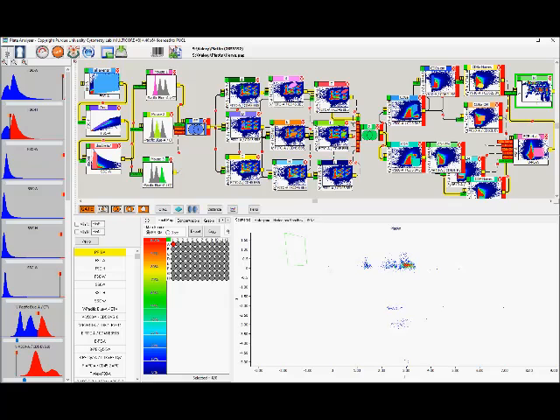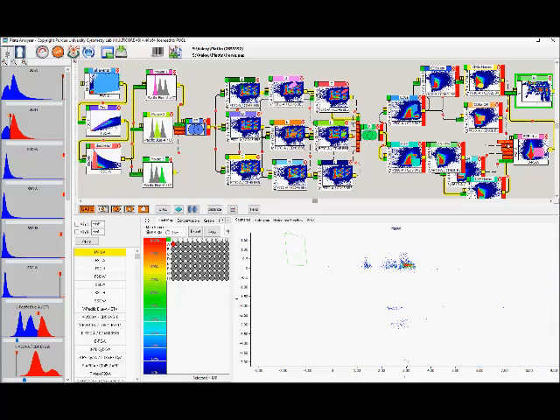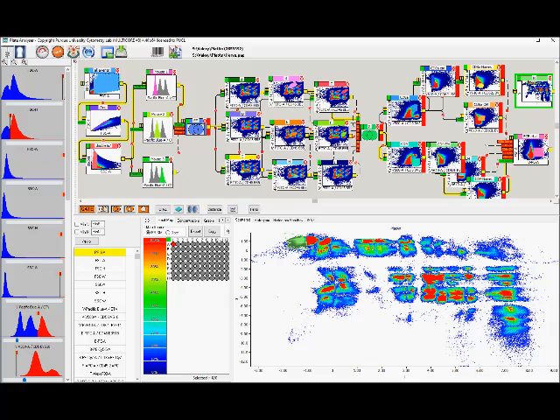So remember that I'm going to disconnect this so I can see this map. But just to repeat that, joining here, as I go through here, I know what those are, CD8 naive cells, CD8EM, CD8CM, etc., etc. And that, in theory, tells me where they are on this map.